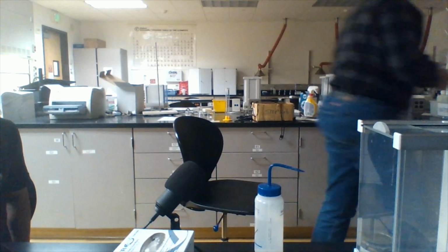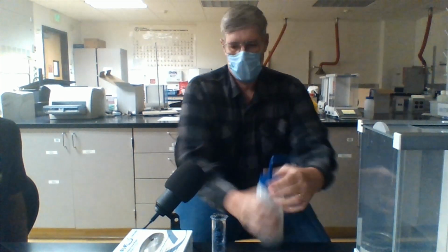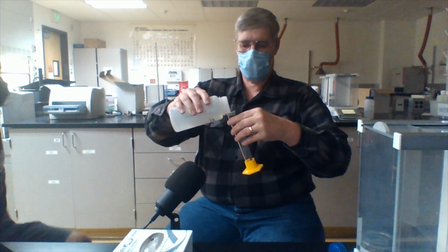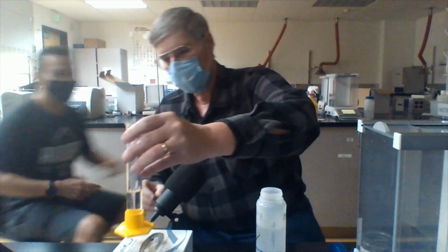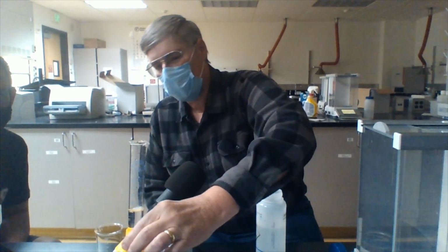We will now do the same thing for metal cylinder 2. I need a beaker, just someplace I can dump the water in when we get the cylinder. Okay, so that'll work. All right, switching cameras to record our initial volume.